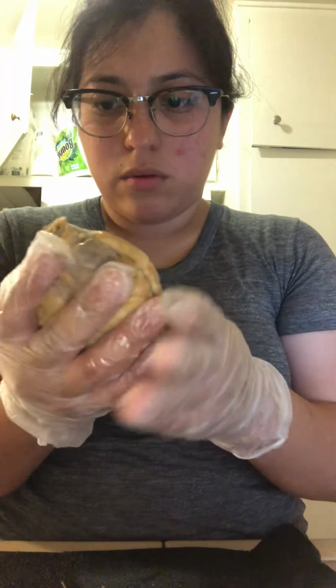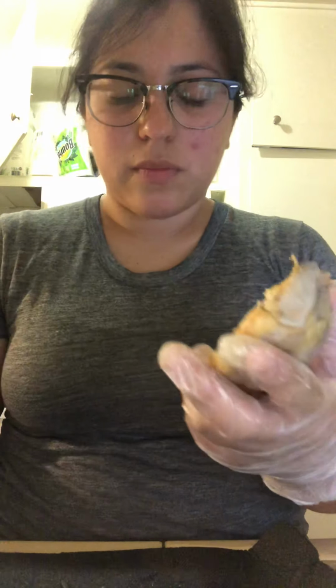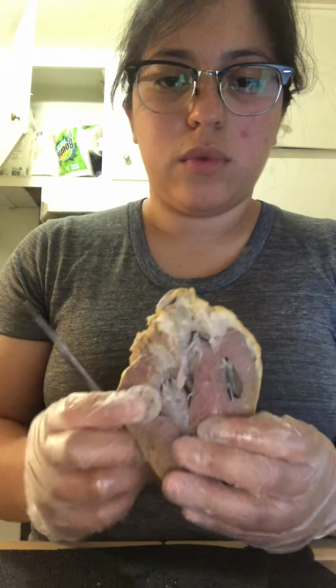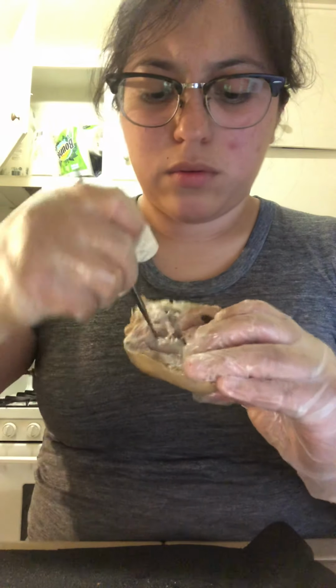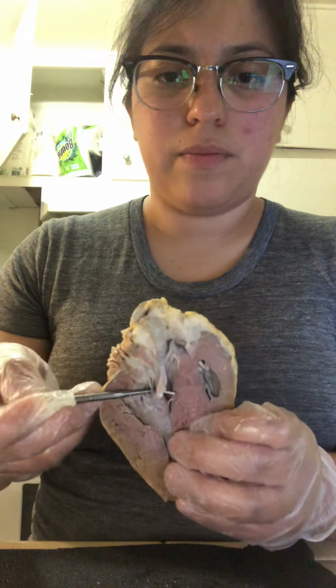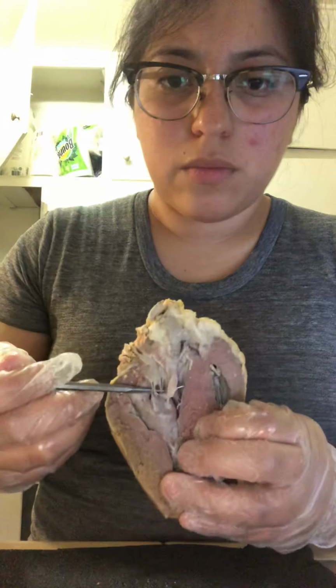This right here, let's see. Oh, it's because I cut it wrong a little bit, but okay. So this would be the chordae tendinae. Right here, just little strings right here. Chordae tendinae.